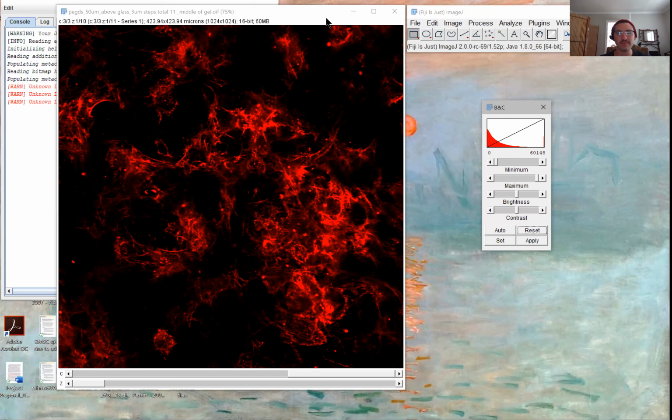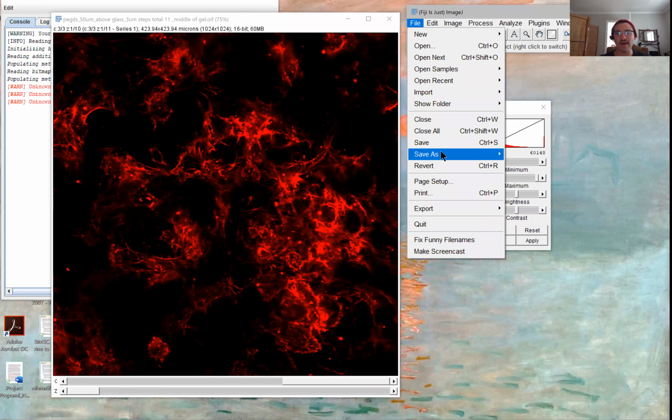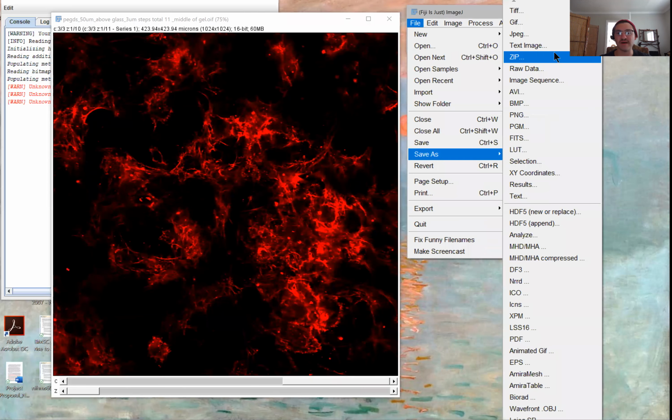So whenever you're manipulating it, like I just did here with the original file, I honestly never press save. I always do save as, and then I pick a PNG, or a TIFF or a JPEG.